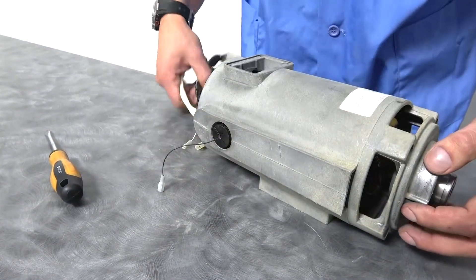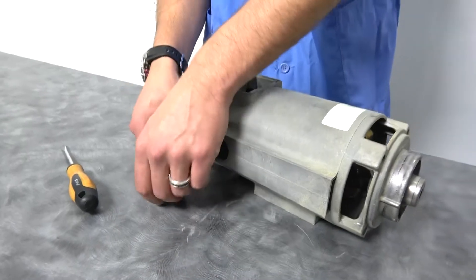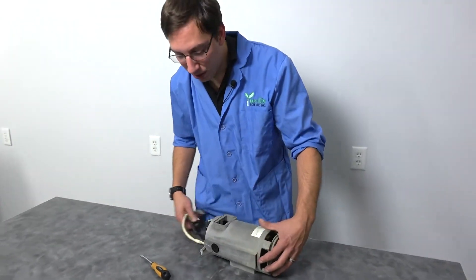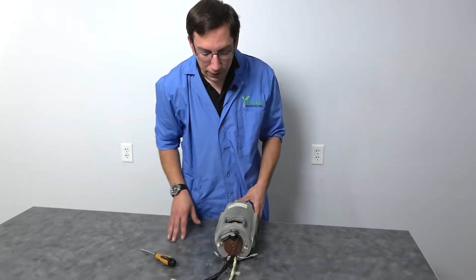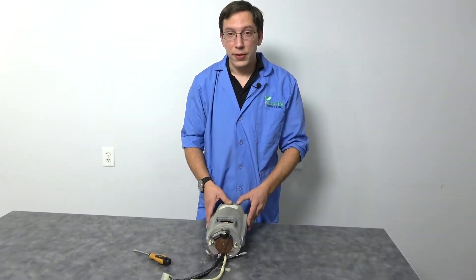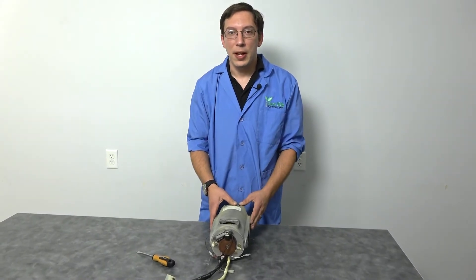And there you have it. Now you know how to change the brushes on your brushed drive. Don't forget to reconnect your connector. And that will do it for us for today. Thank you and have a good day.